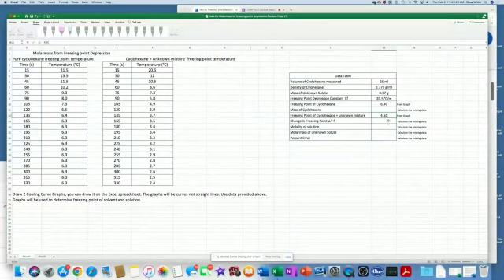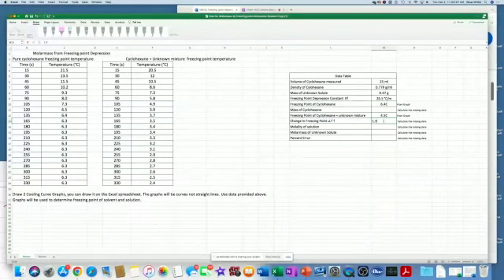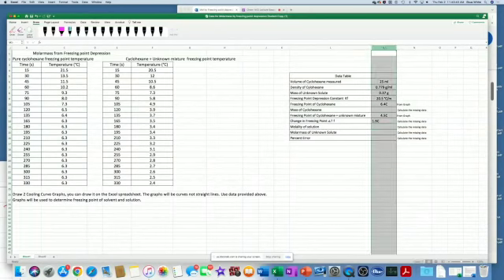That's okay. I'll go with those numbers. And so the difference I got here was 1.9. To get this better, you should print it out and then get those numbers manually, because somehow I just feel like this is a little bit too small. But anyway, this is what I got for right now, 1.9. I don't know why this one's a little bit lopsided.